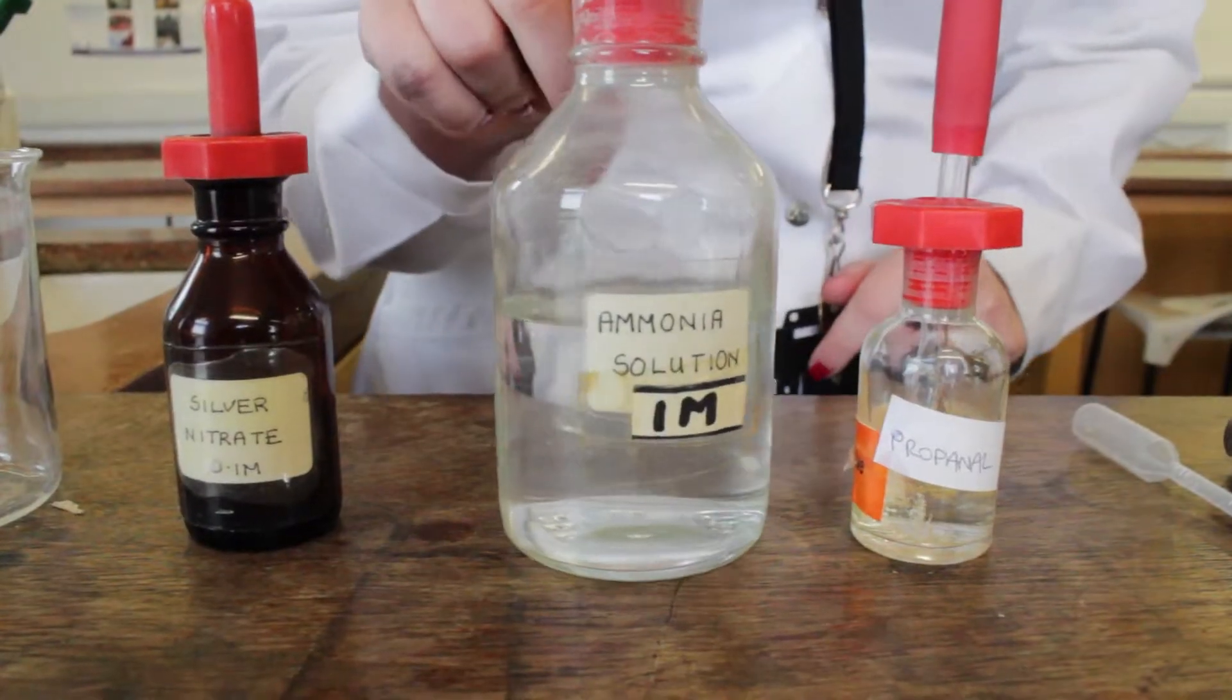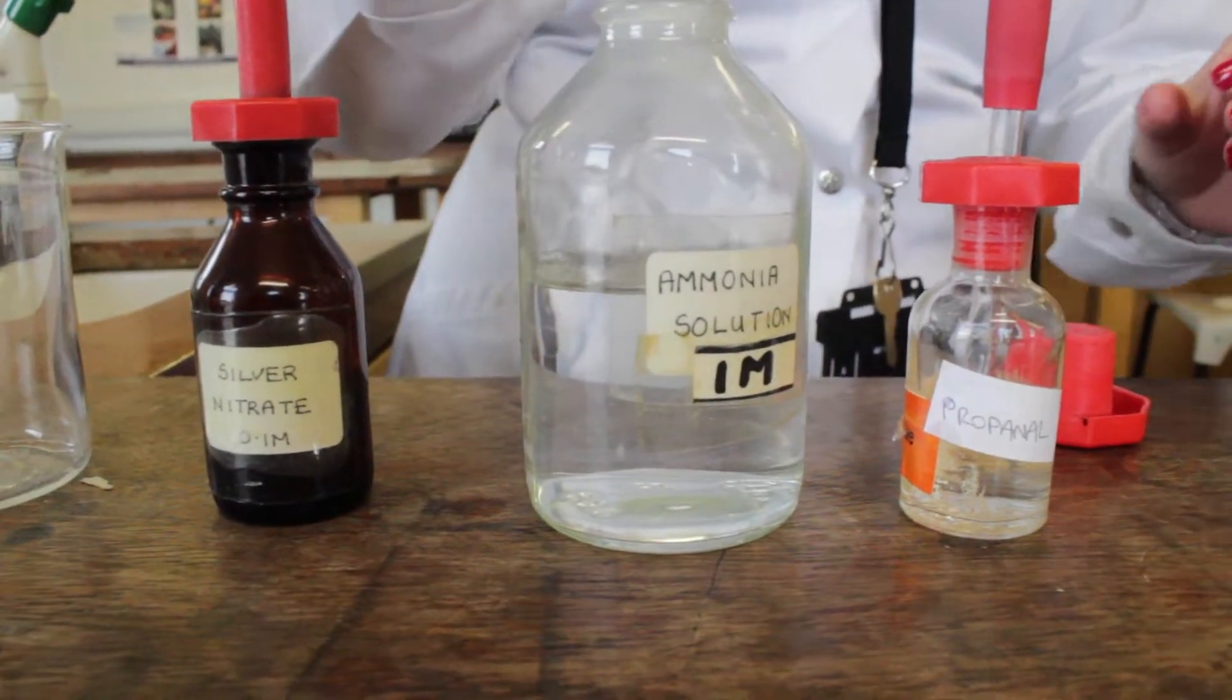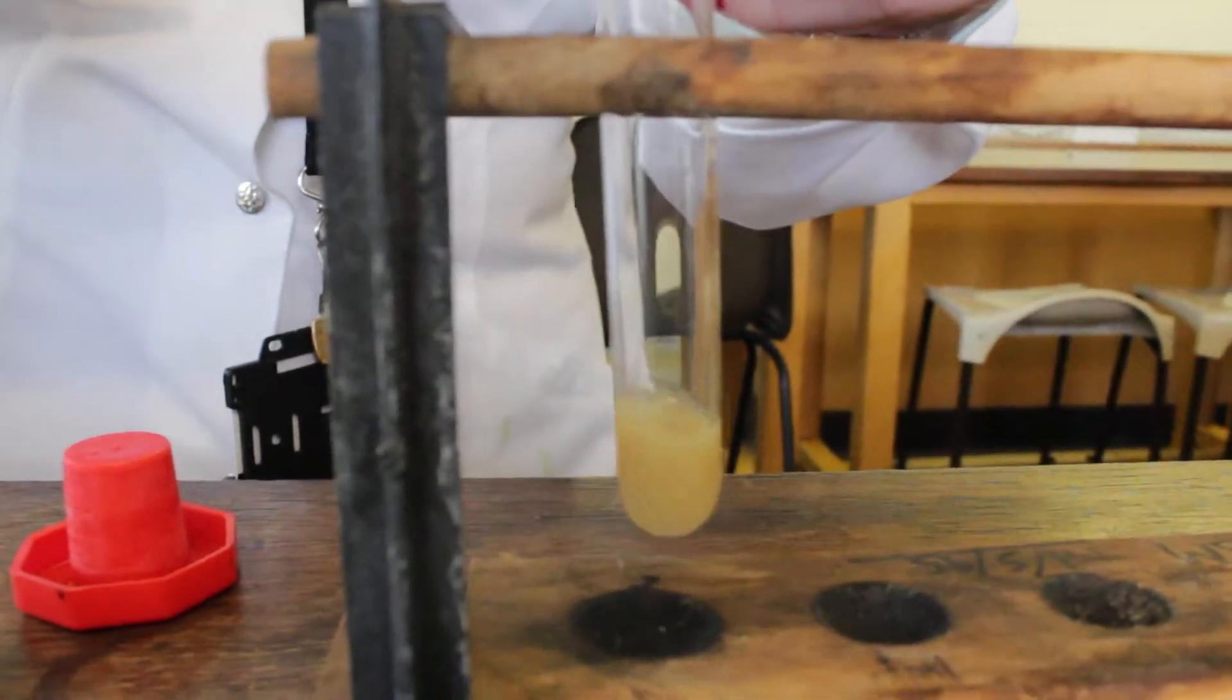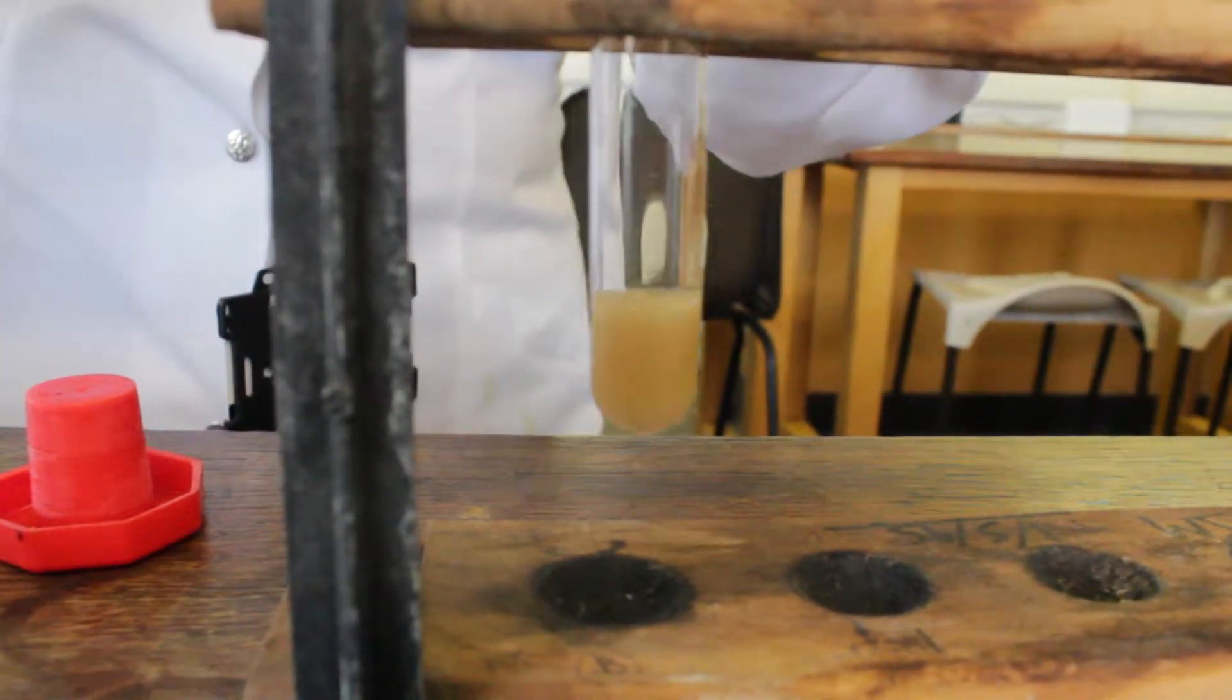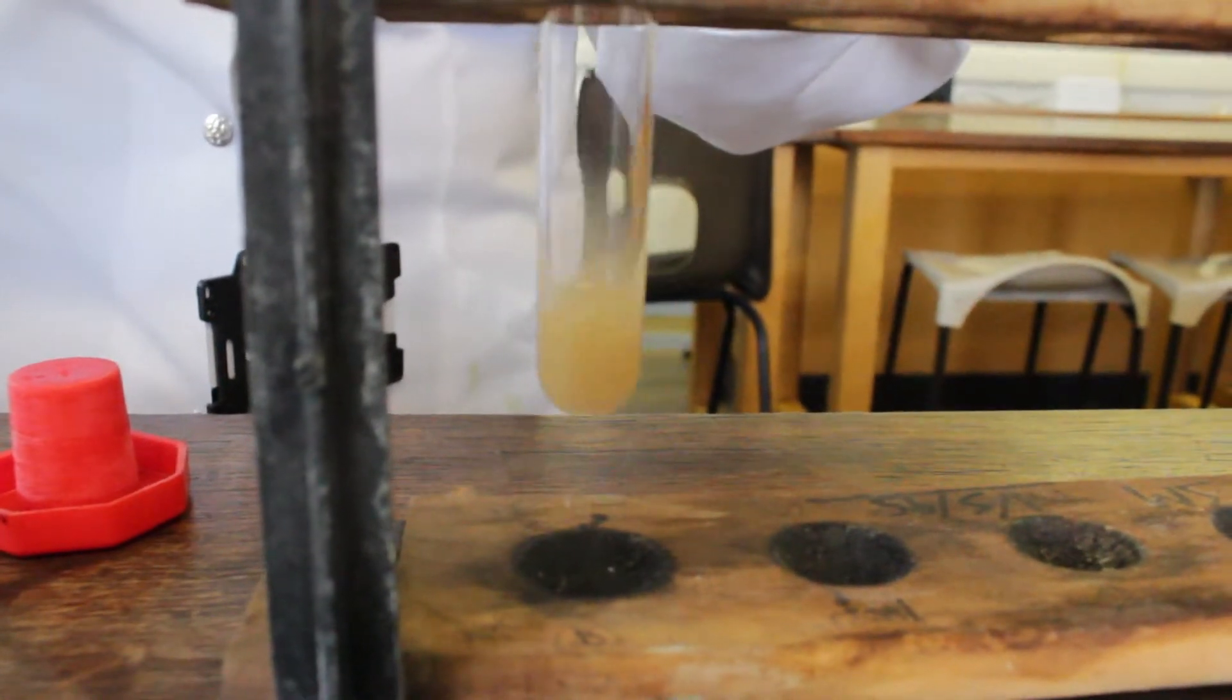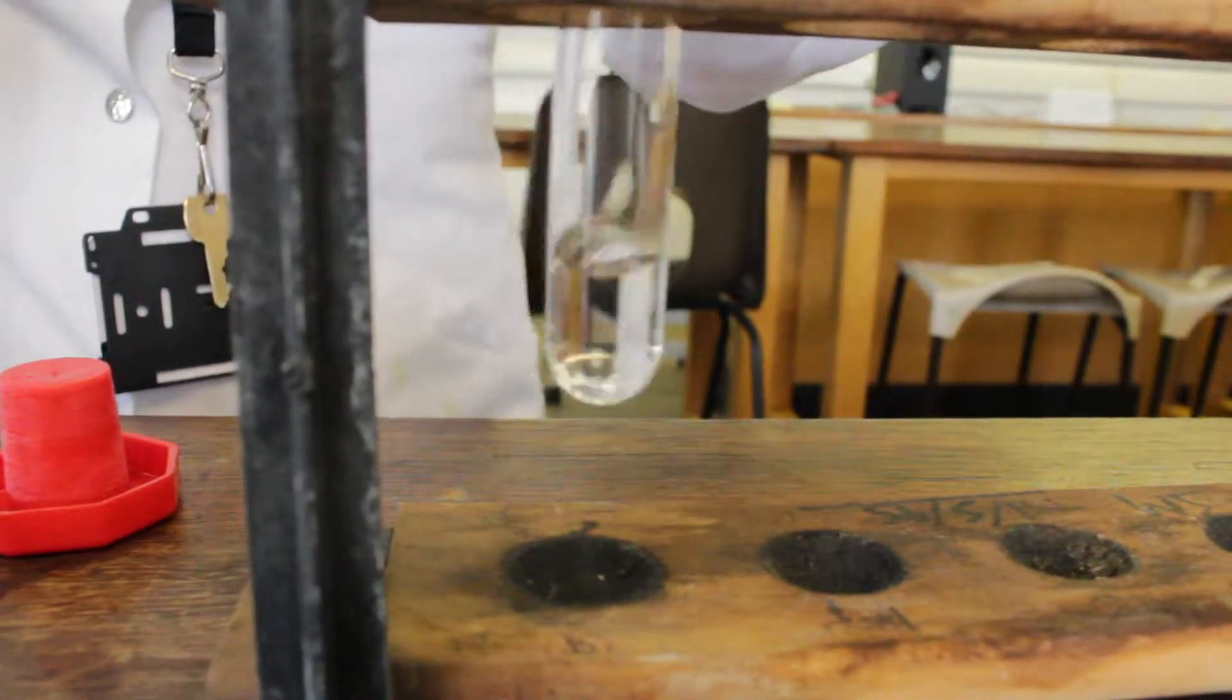We're now going to add the ammonia solution. It's important to add this drop by drop. As you add it drop by drop, give it a shake. You should see initially a precipitate of silver oxide forming. There we go and then it disappears.